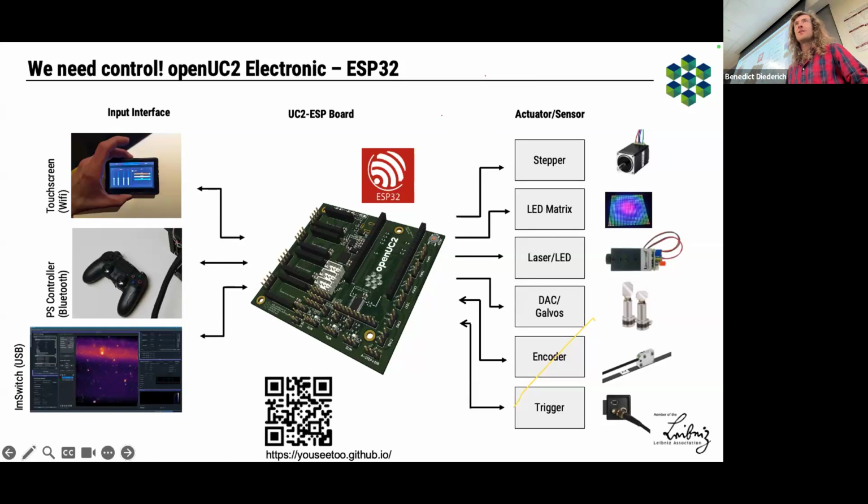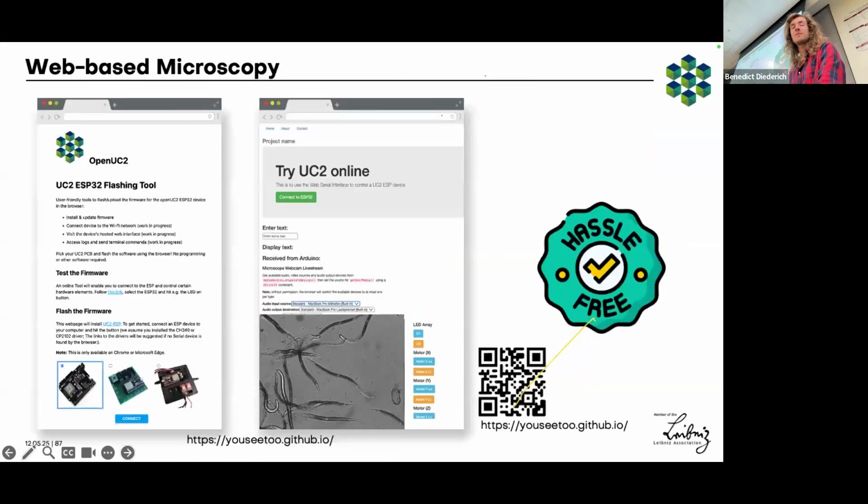What's also nice is, it's probably not only true for the ESP32 that we use as microcontroller, but also for others. One thing that always annoys me a lot is installation. Nowadays, modern browsers can be used for controlling, for example, your webcam, typically used for Teams stuff.